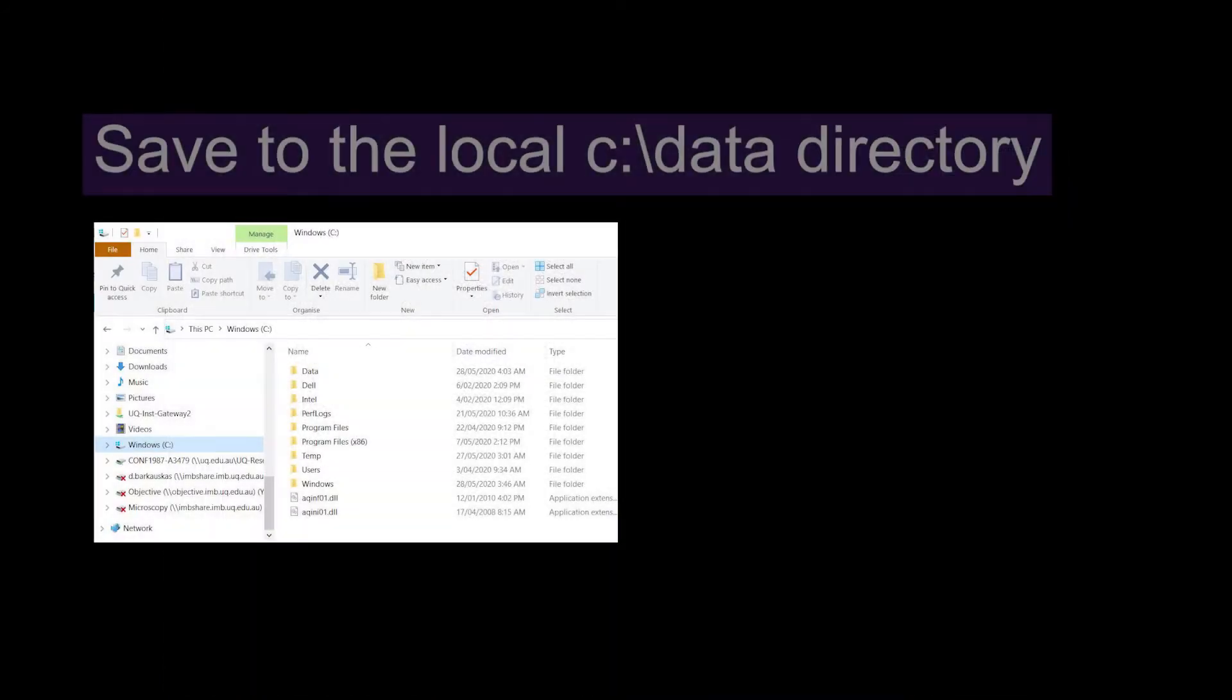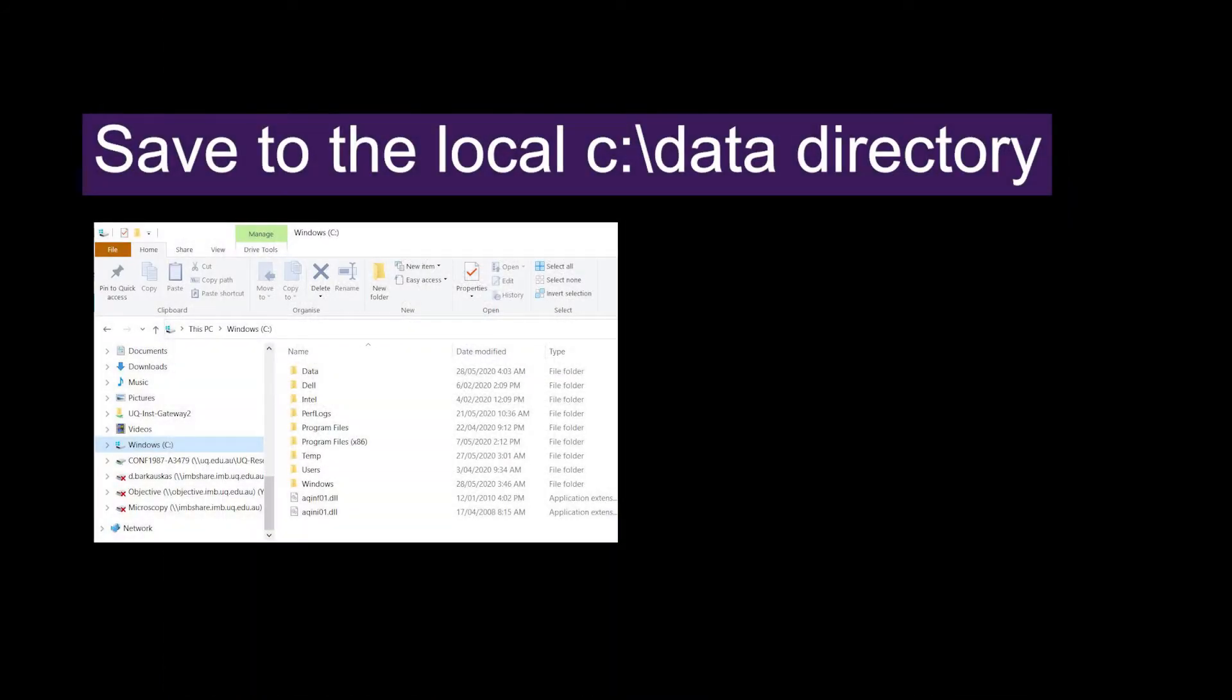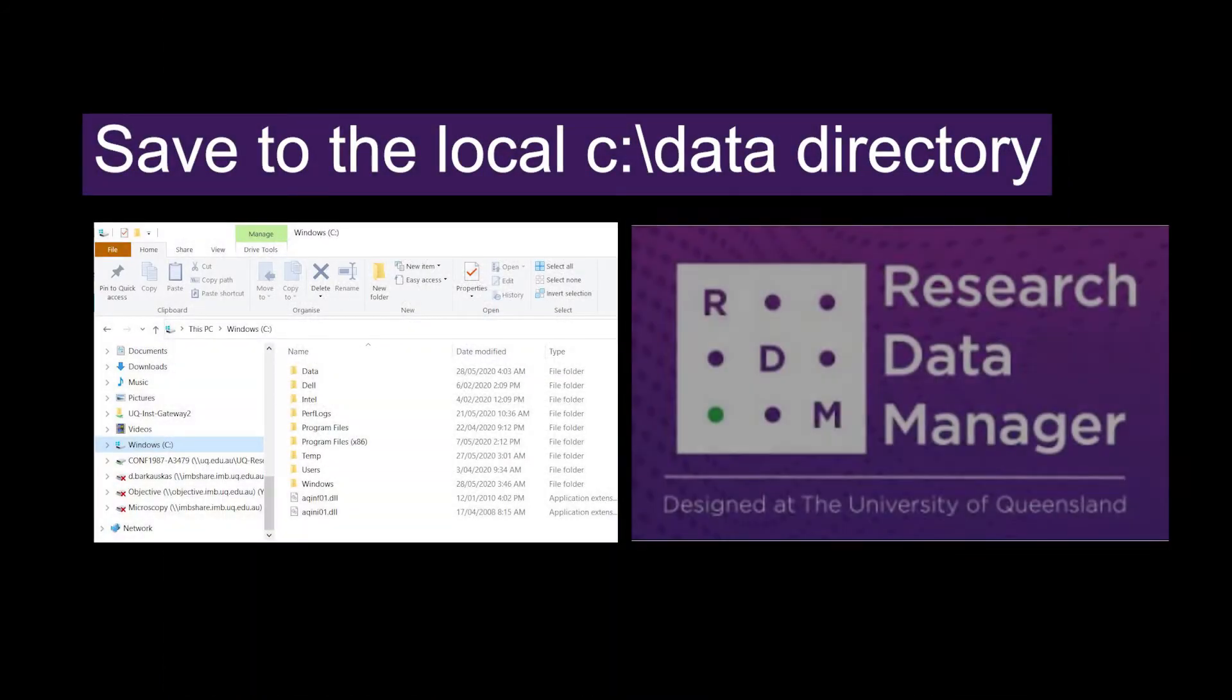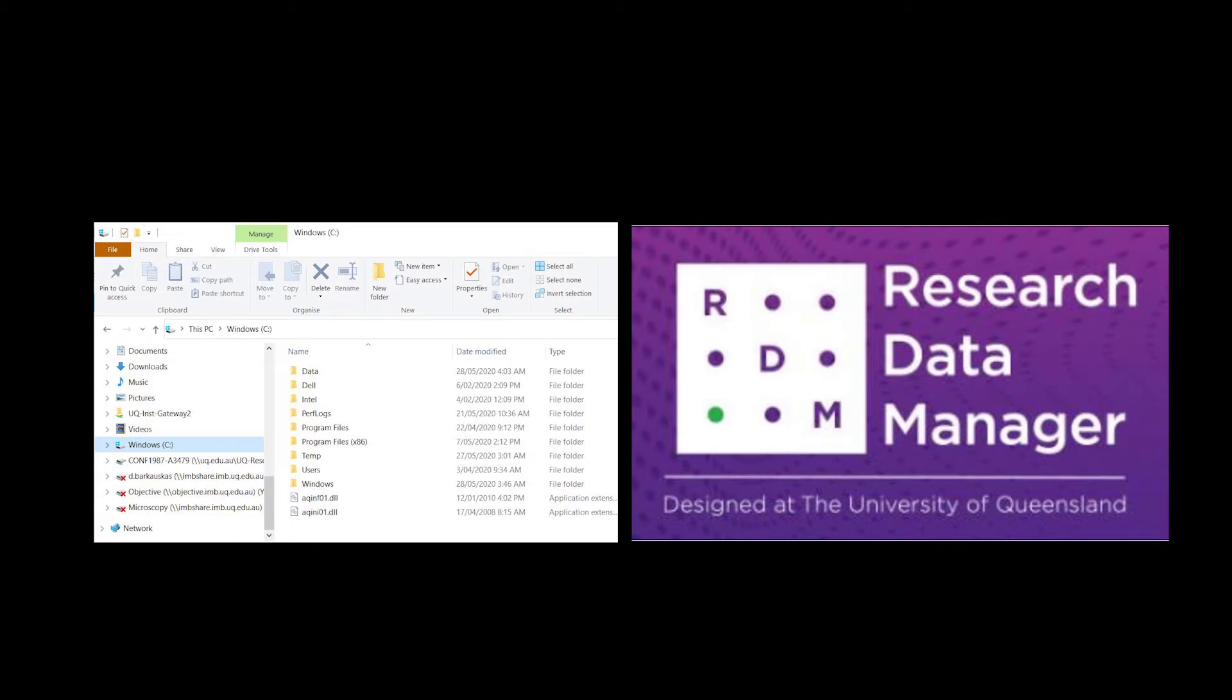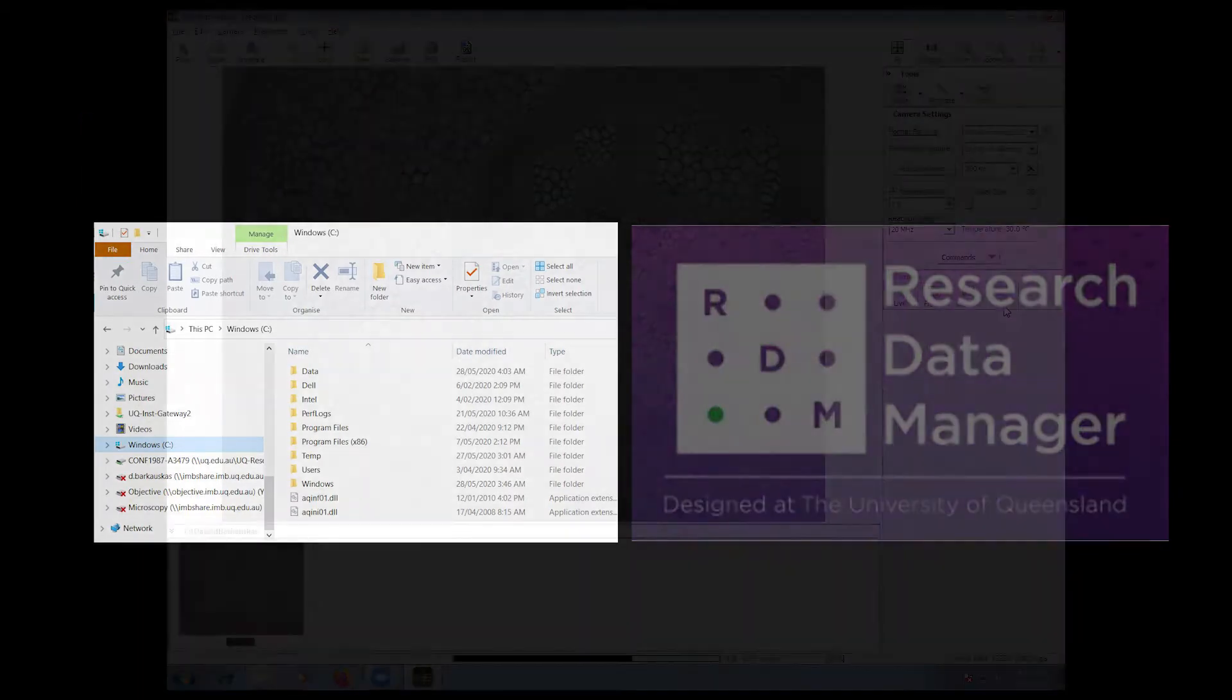Do not save directly to a network drive. Save it locally and transfer your files across at the end of your session.